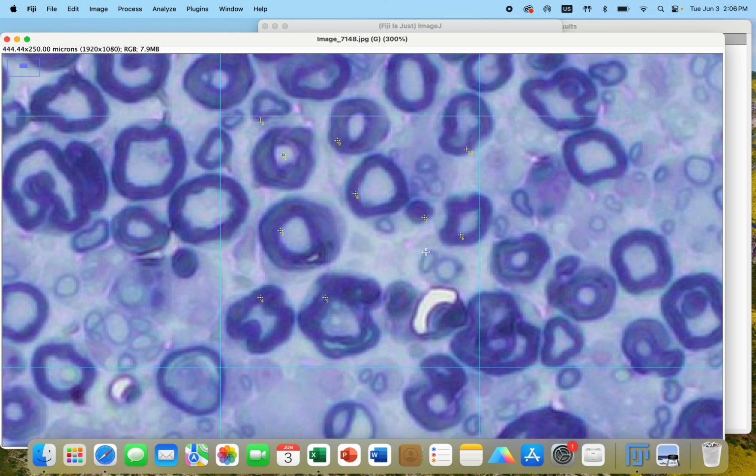Another point in here, you can see that there are newly sprouting baby myelinated nerve fibers. It depends on you, but if you would like to count these axons, actually this is the nucleus of the Schwann cells, I guess. Yeah, this one is the myelinated axon. It's better to evaluate them separately because it can lead to misperception in your countings.